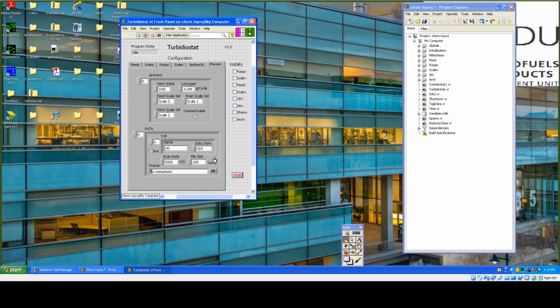At this point, there's not really too much to say about the archiver. While it's running, it doesn't really have much of an output, so it's not very useful to fire the system up and demonstrate it running. What I did do is run it myself for the simulation runs that have been part of these demonstrations, and I forwarded that in an email for you to look at. At any rate, that's about all there is to say about the archiver at this point.